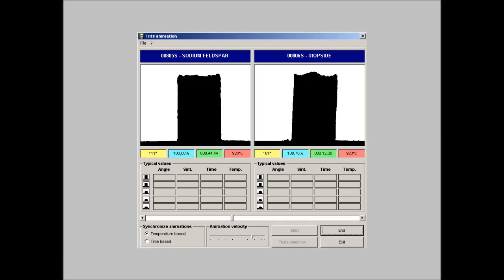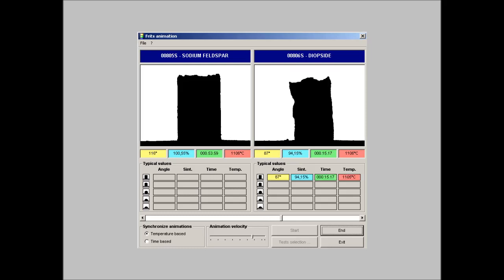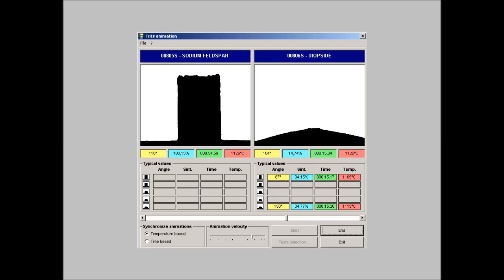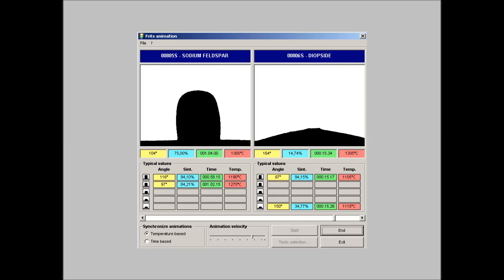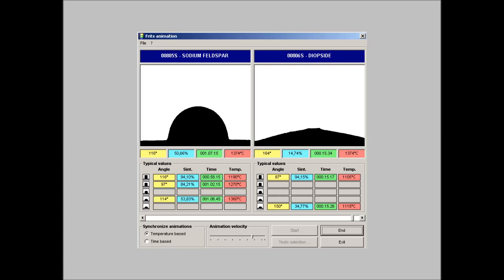This is an example of animation of two samples of different minerals. The images are synchronized by temperature. In this case we can see a comparison between the incongruent melting of sodium feldspar which becomes progressively liquid forming a glassy phase and the melting of a diopside which is becoming suddenly liquid when it reaches the melting temperature.